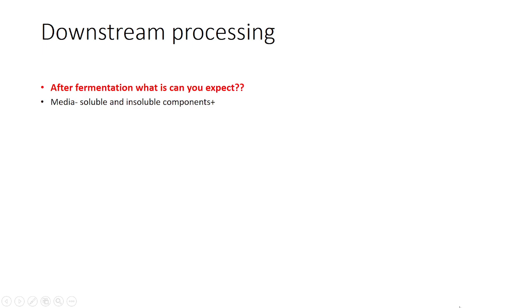Now let us look at the topic downstream processing. So after a fermentation process is completed inside a bioreactor, what do you expect to be present inside the bioreactor? Obviously, there'll be the media that was given. The soluble and the insoluble component of the media will be there.